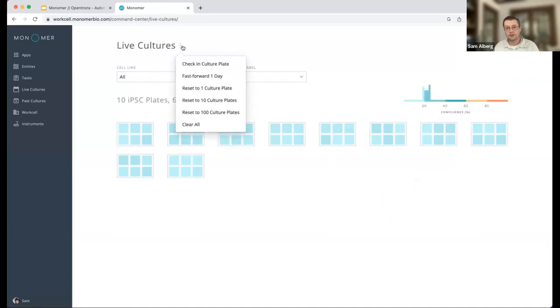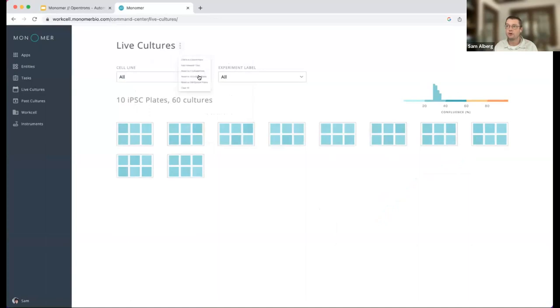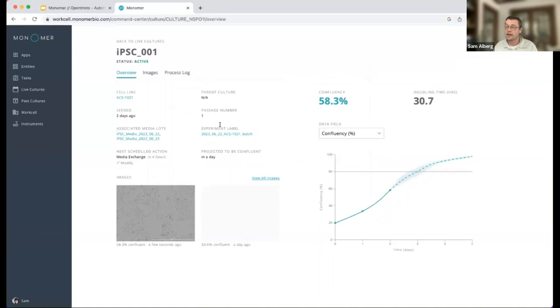In my demo, I'm going to simulate that these cells are growing up in the incubator. So I'm moving forward through time. I'm going to move forward 2 days. Over the course of those 2 days, these cells are now growing.